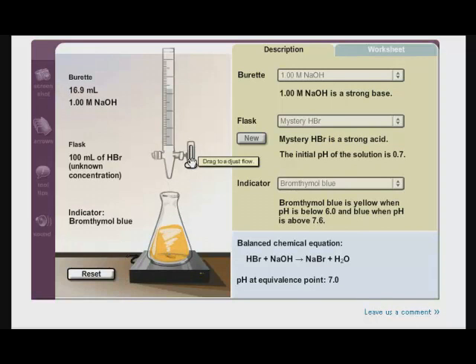Starting to turn blue, so we're going to slow it down. And we're going to stop when the solution stays blue. That's going to be our endpoint. Almost there. We are there.